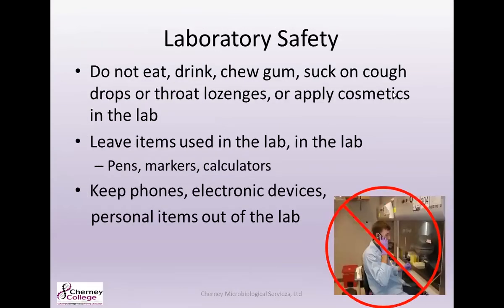You're also going to want to make sure that you're not eating in the lab, drinking in the lab, chewing gum, or sucking on any cough drops or throat lozenges, and obviously don't apply any cosmetics in the lab. So don't put on any chapstick or anything like that. Make sure that any laboratory items that are used in the lab stay in the lab or in your lab coat pocket. Make sure you're not transferring items from the lab into your offices or taking items home with you.